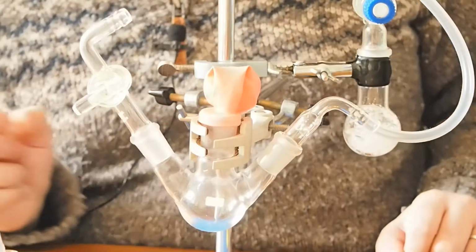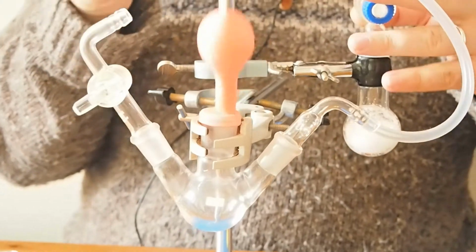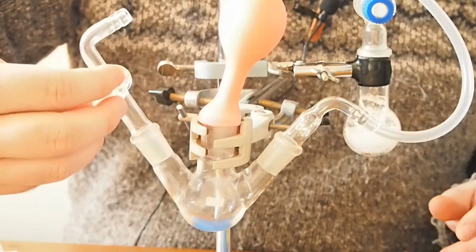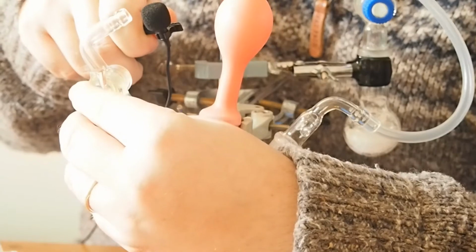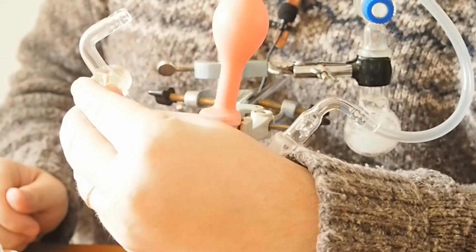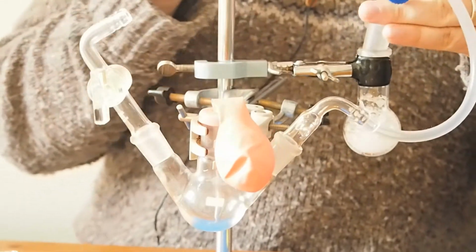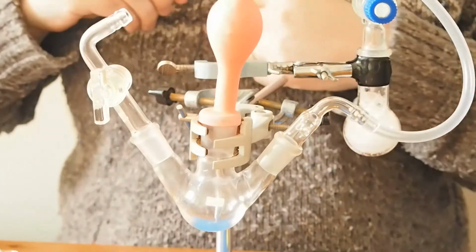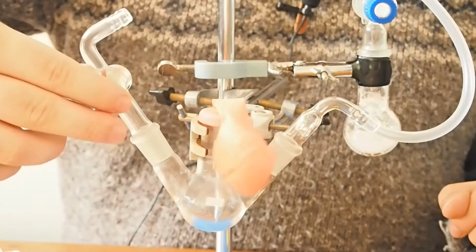I should maybe add just a little bit more. Oh, there we go. Excellent. You can see it's starting to fill up. I'm going to open this tap a little bit. If I put the microphone near, you'll be able to hear the flow. So we've got a flow of carbon dioxide coming through. So what we can do is use this to control the system we're working in.